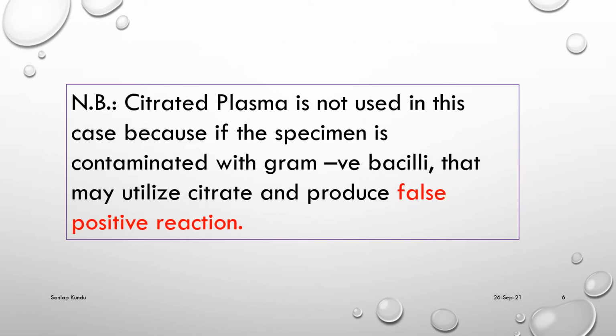Here one thing to remember is that citrated plasma is not used in this case, because if the specimen is contaminated with gram-negative bacilli, they may utilize citrate and produce a false positive reaction.